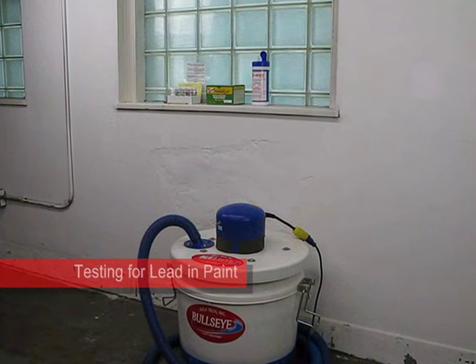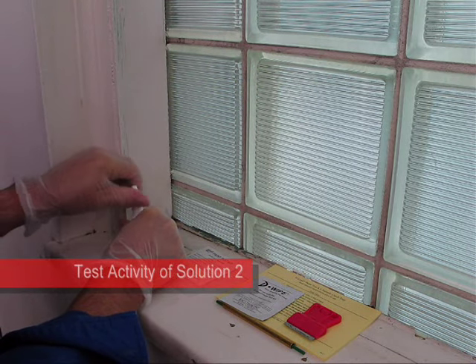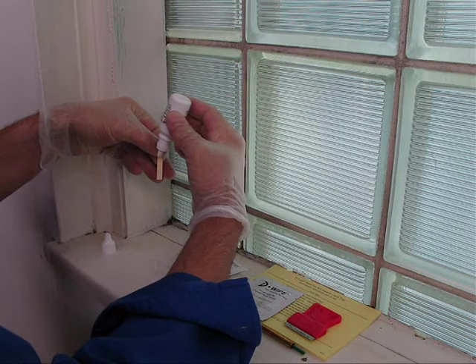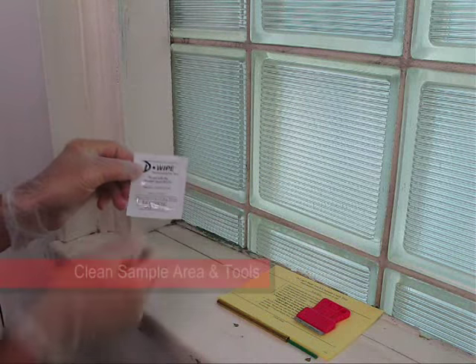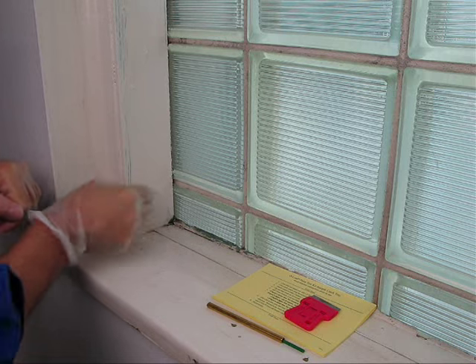In this video, we test the paint on a wood window frame. Solution 2 is the active component of the test kit and can be affected by age and storage conditions. Prior to testing, place a drop of Solution 2 onto a new verification test strip. An immediate color change to black confirms Solution 2 is working properly. Use a de-wipe towel to clean the sample area and your tools for the most accurate test results.